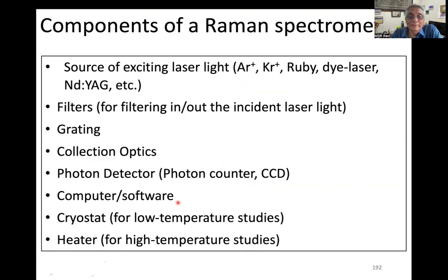if you want to record Raman spectrum or Raman spectra as a function of temperature, which is useful in many ways. That low temperature Raman gives you more useful information about the modes that cannot be captured at room temperature because of thermal energy interference at room temperature.